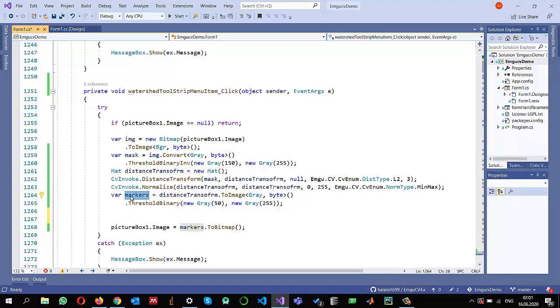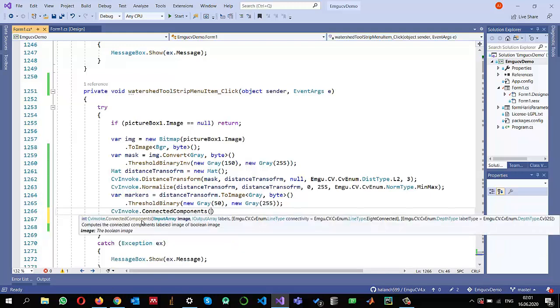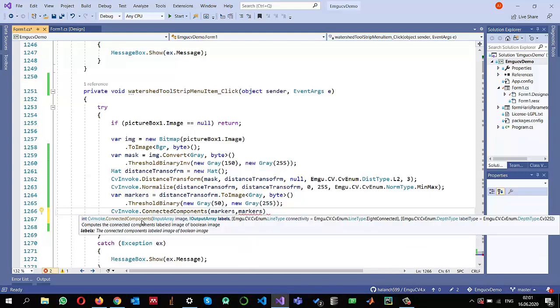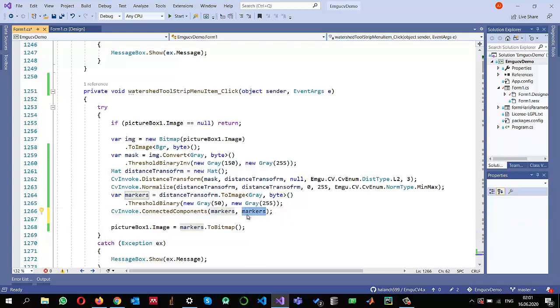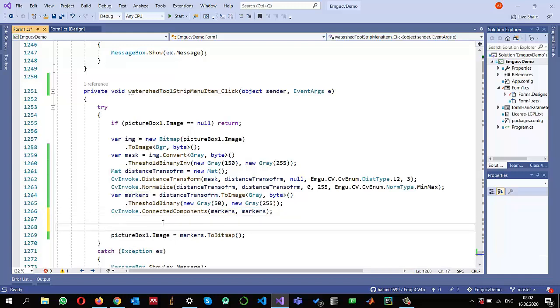To assign unique values I will use the connected components method: `CvInvoke.ConnectedComponents`, passing `markers` as input and storing the labels back into `markers`. This assigns a unique value to every separate object — 1, 2, 3, 4, and so on — so we can identify every object before passing it to watershed.